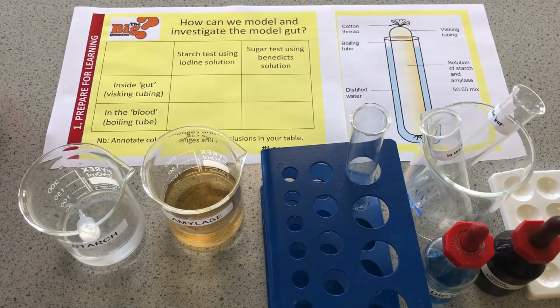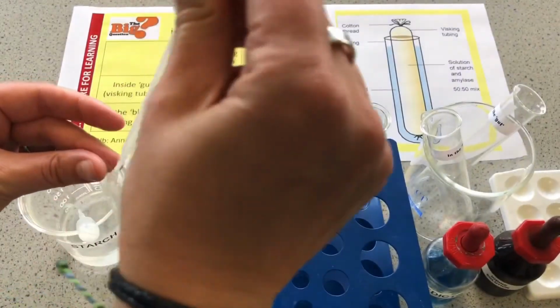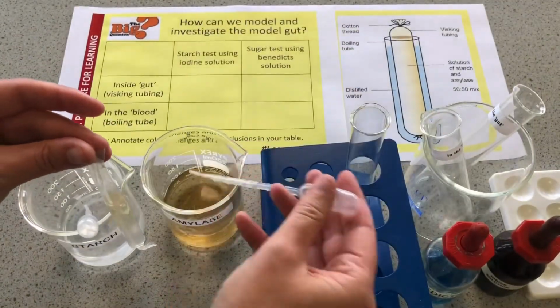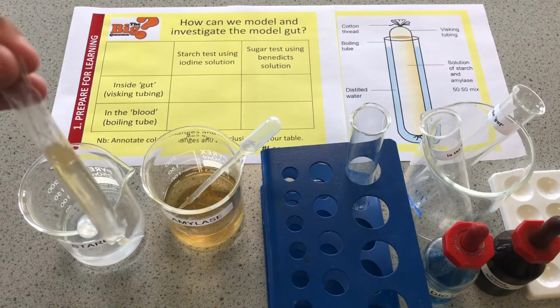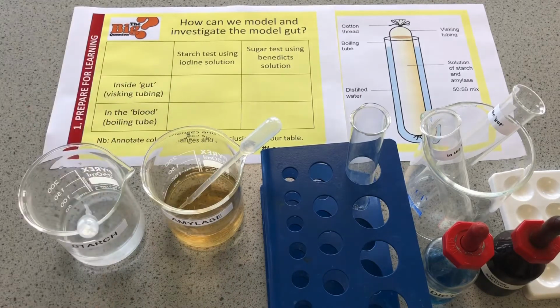I'm then going to have some of my amylase, which is my enzyme to break down that starch into glucose. I'll put a decent amount in so I get the result quite quickly. And that should take that starch, and the starch will keep entering the active site of the enzyme. And don't forget, those enzymes are reusable. So as soon as they've had some starch enter there and the bond's broken in the starch, another section of starch can enter that active site and continue the process.